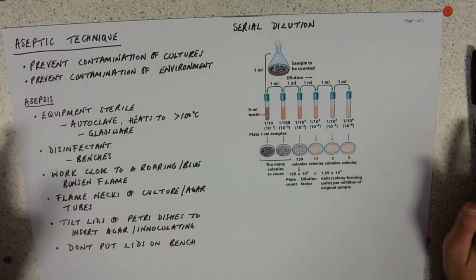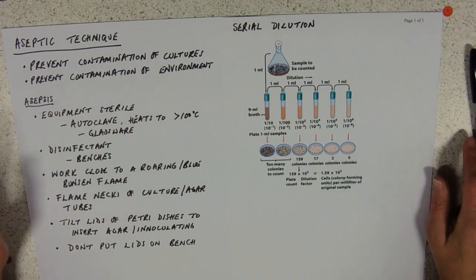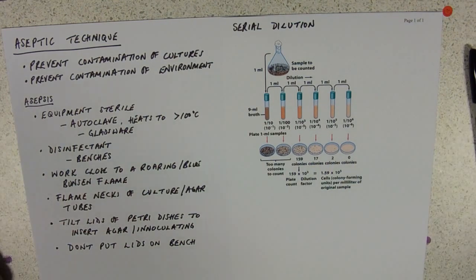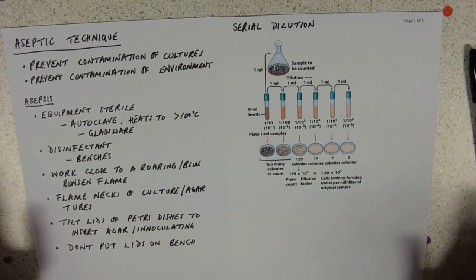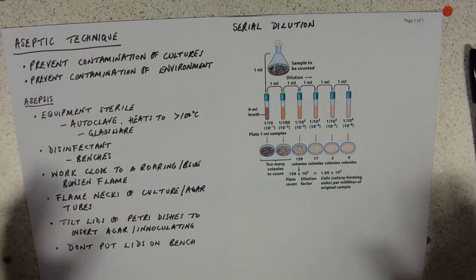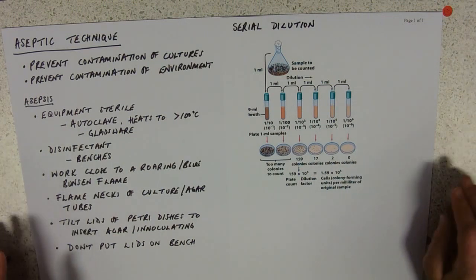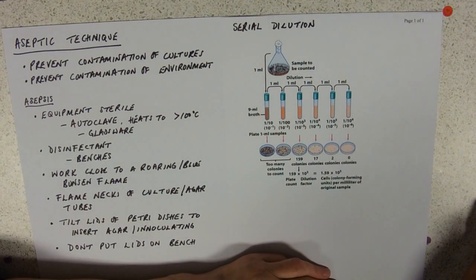Well, when we're taking samples from the environment, you're taking it from a cream cake or a burger van or the school canteen, a sample of seawater, tap water, river water. Probably you've got about 11 billion bacteria in there, and you'll have lots. And so in order to be able to see which ones are alive, which are the ones that you're most interested in, the dead bacteria are neither here nor there, you will need to dilute that sample first.